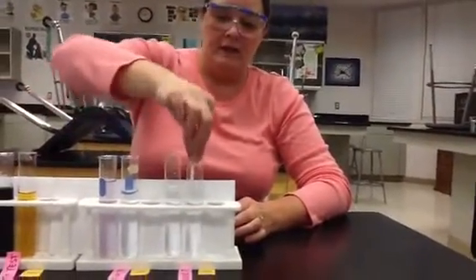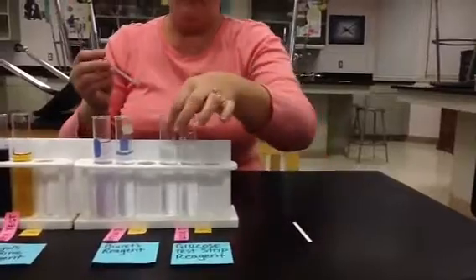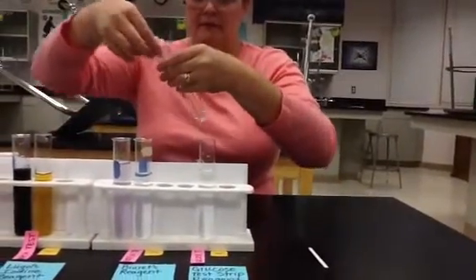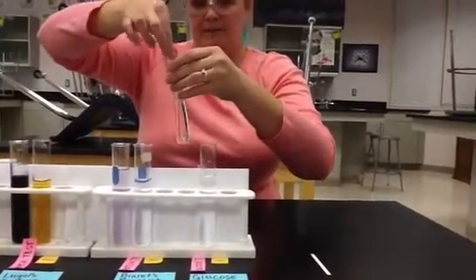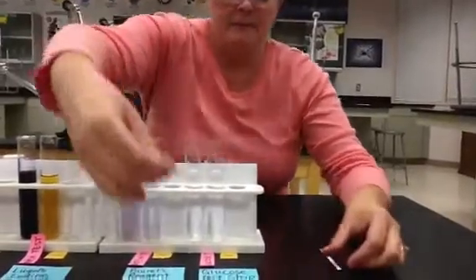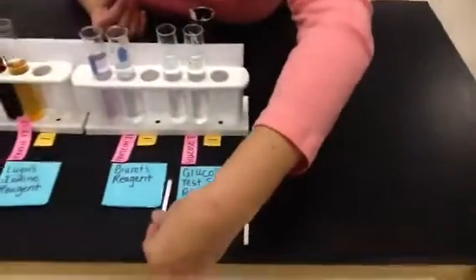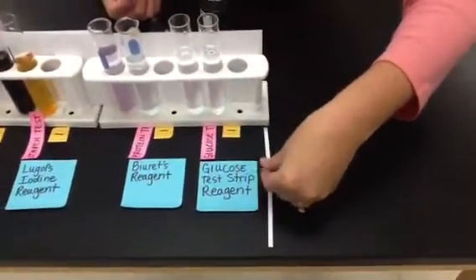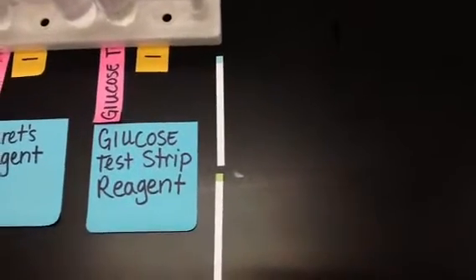We're going to let that sit and rest for a second. And then I'm going to do one for our glucose. And sometimes these take a little bit to turn. So you're going to see the difference here in a positive test and our negative test. Let's put our negative test up here. So you'll see that it turned a green. So anything beyond that blue color is considered a positive test.